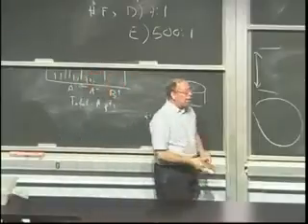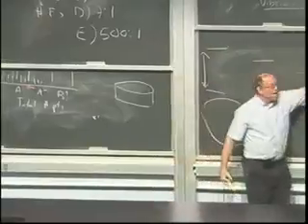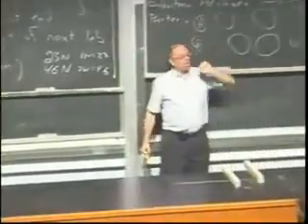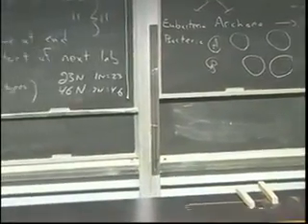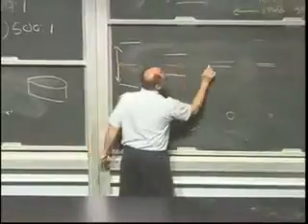So when we look at specimens, we literally optically section them. We see a thin part of that specimen that's in focus, and if we have a higher power, the optical section is even smaller. So as we increase magnification, we increase the ability to have resolution, and those sections are smaller and smaller, okay? So with the microscope, we are doing optical sectioning. The midpoint should stay fairly constant. So as we change the magnification, this should be fairly constant, like that.